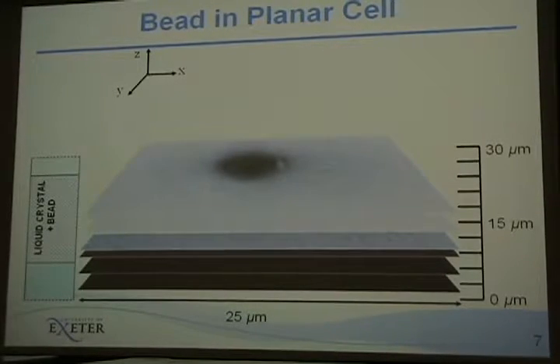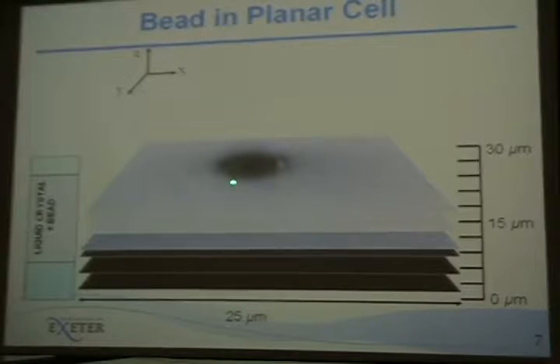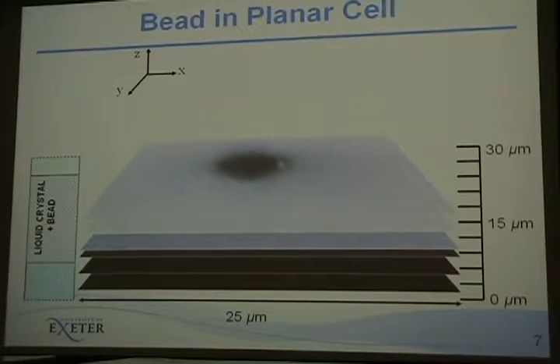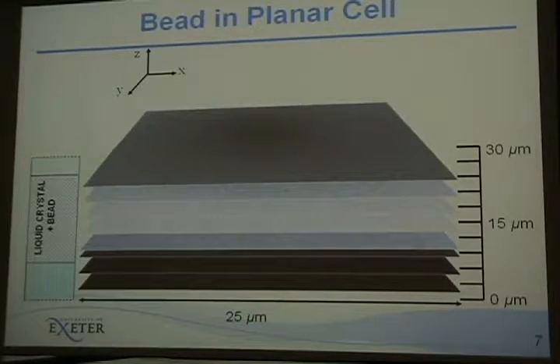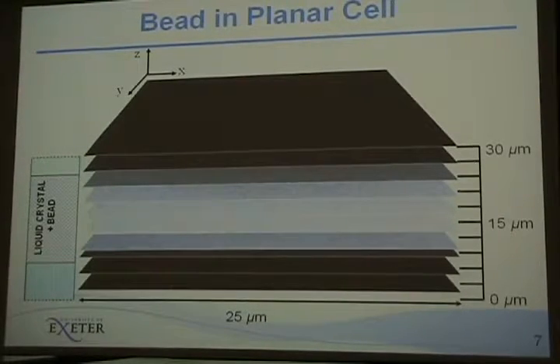You can see as we're getting up through the cell, this is the location of our bead, because it's black and the glass doesn't actually fluoresce, therefore it looks like a dark patch. You can actually see we're starting to see some kind of defect at the edges. Again, stepping back up through the cell, we're now moving away from the bead and back into the upper glass.